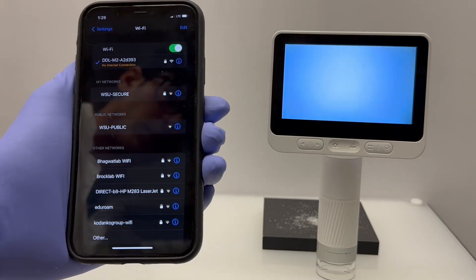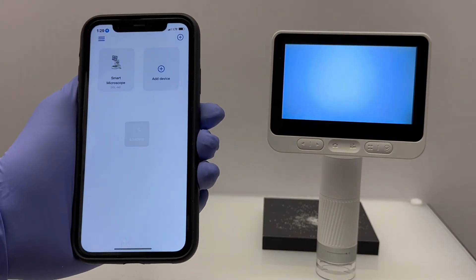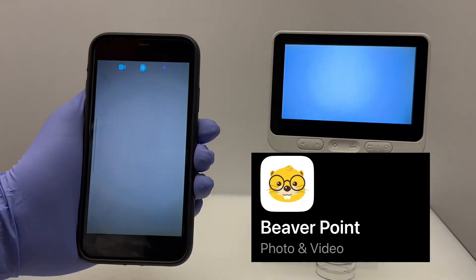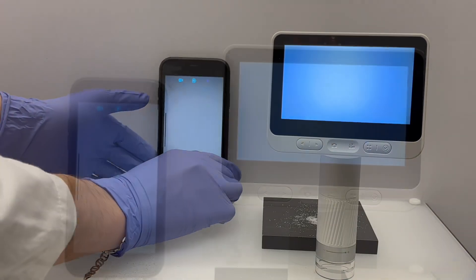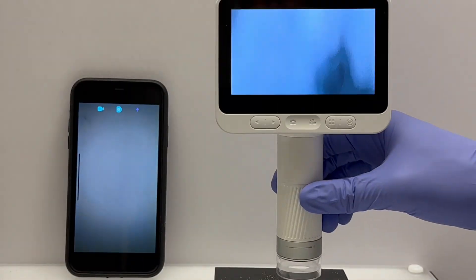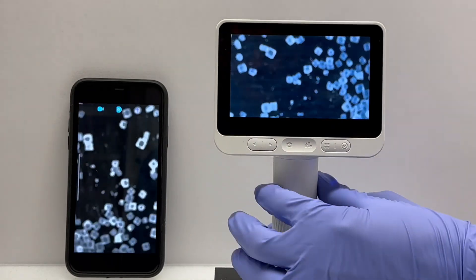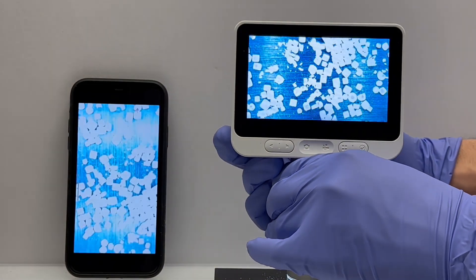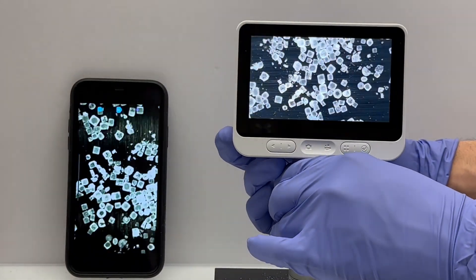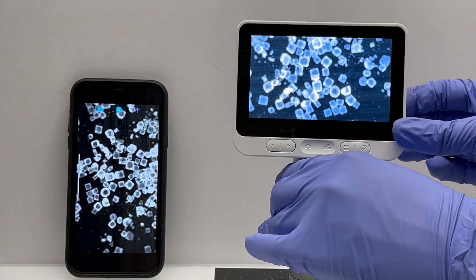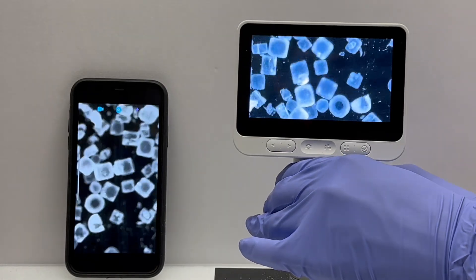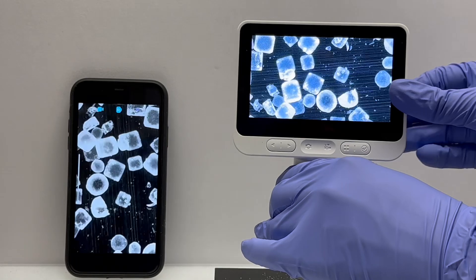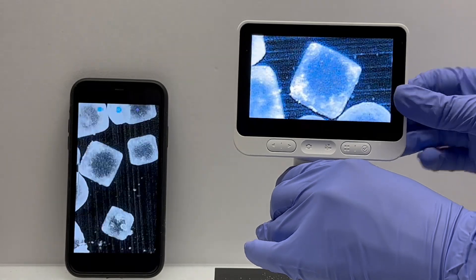The setup was really easy, even for an old guy like me. After pairing the microscope with my cell phone through the Beaver Point app, I could display images directly to my cell phone. Here you can see me viewing crystals of table salt with the microscope. Adjustments of the lighting, zoom, and focus are directly done on the microscope interface, and the image immediately updates on the phone.